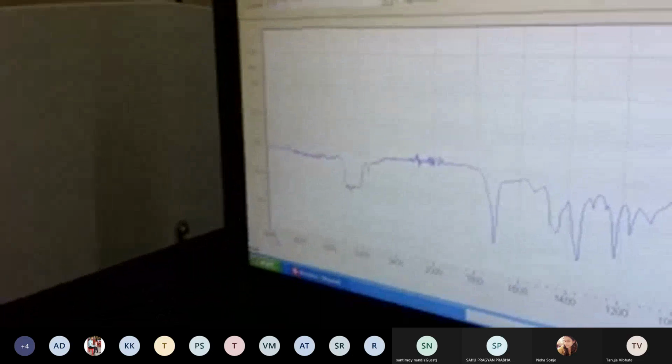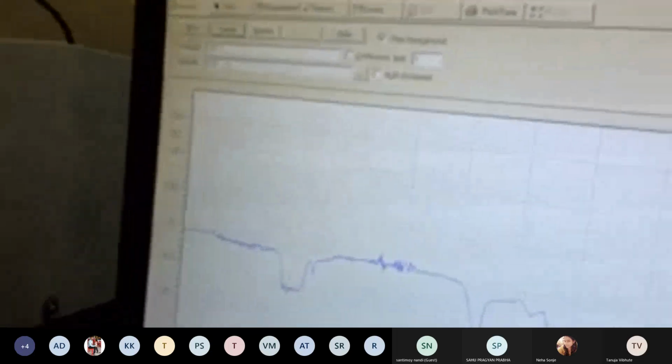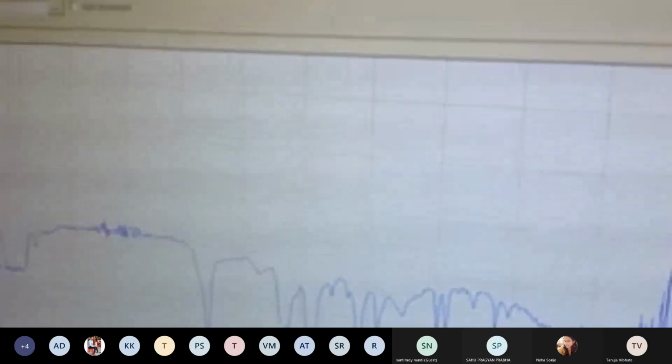Now you can tell me what to do on the command here. What will I do? Can anybody tell me what the first step is? So I will go to the left hand side, where I will click on the sample. What I can see here at the bottom is "scan requested". Scan requested means the scan is requested by the computer to the FTIR, and now the scan is coming here.